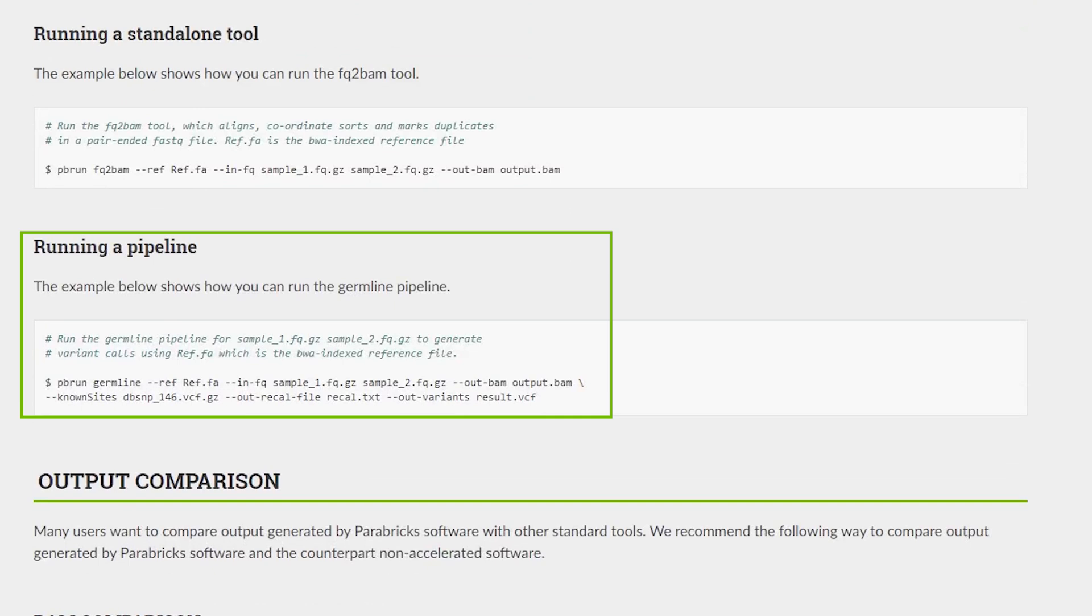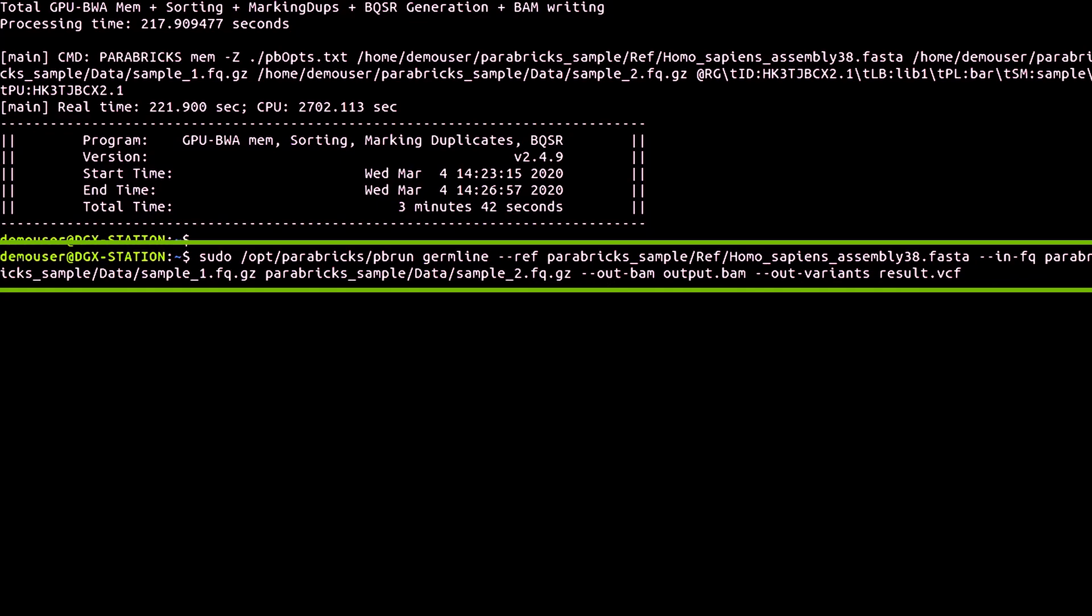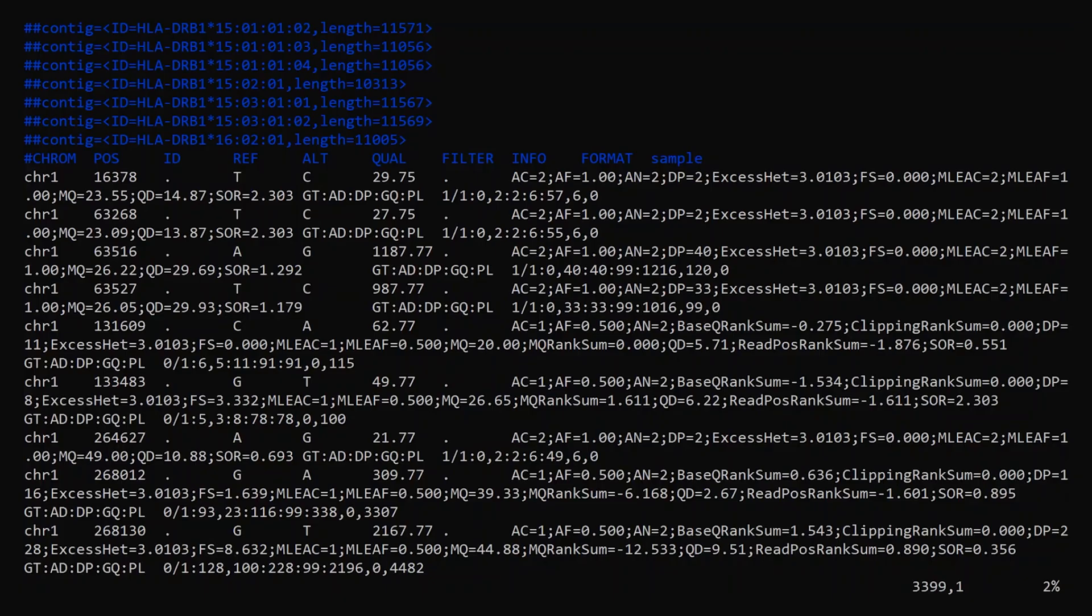To run the end-to-end germline analysis pipeline on the sample dataset you downloaded, you can navigate to the Running NVIDIA Parabricks tab and type in the following command. The results will be your list of variants.